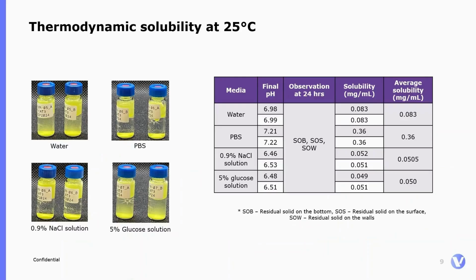As part of the solubility profiling of the molecule, we started by exploring different media compatible with IV delivery. We measured the solubility by HPLC after 24 hours equilibration, and we can confirm that the solubility of Piroxicam is likely to be too low for an IV administration unless some solubilization enhancing formulation is used.